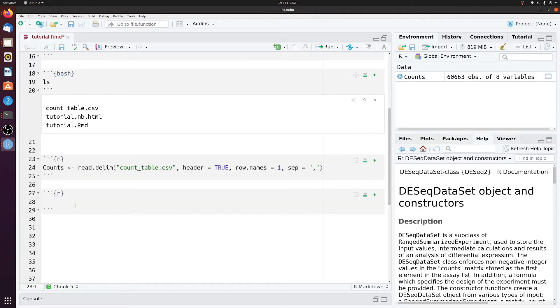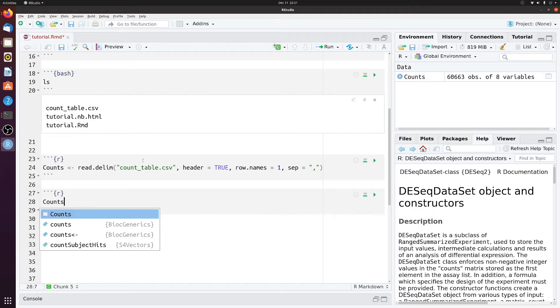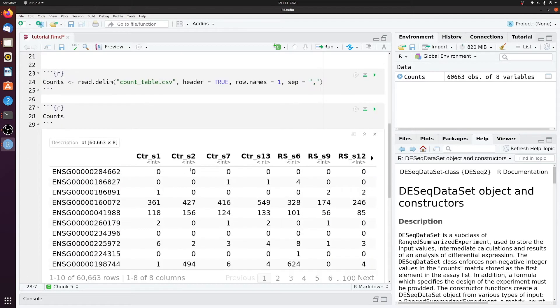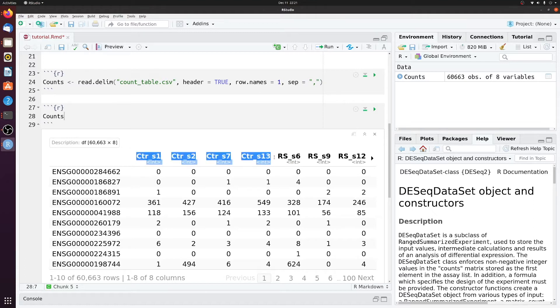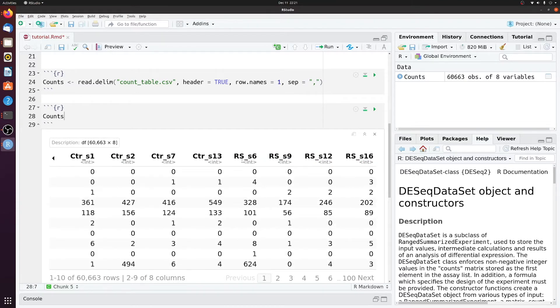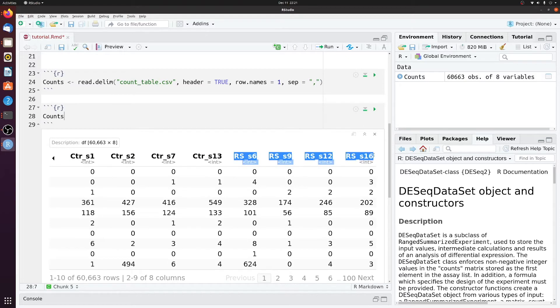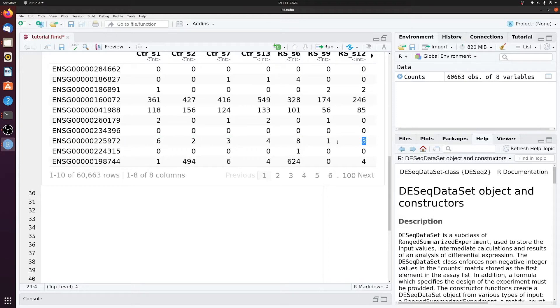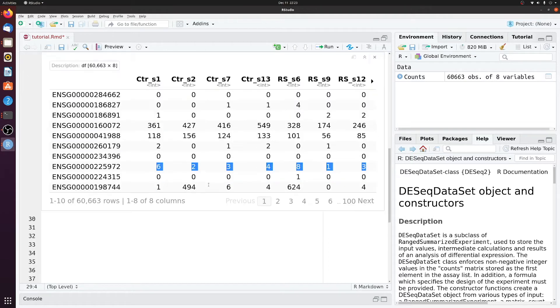So we'll read that in. No errors. So if we look at counts, now we see what we saw in Excel earlier, now in a data frame in R. So we see we have our four control samples. And then three plus one more here of the senescence samples. So eight total samples. And we see a lot of these are zero or only have a few mapped reads.